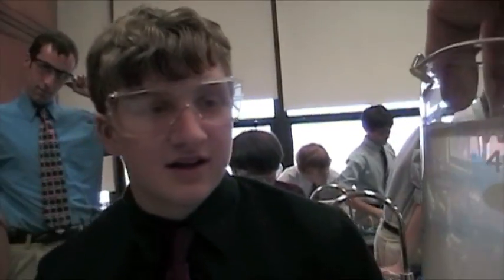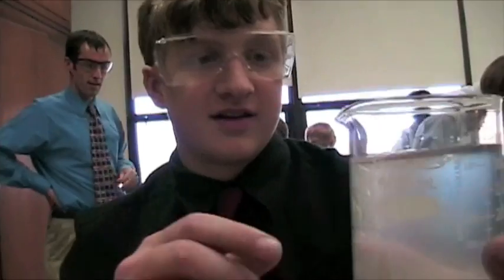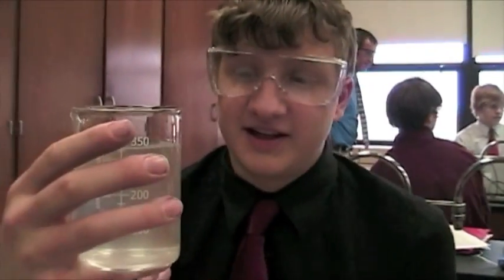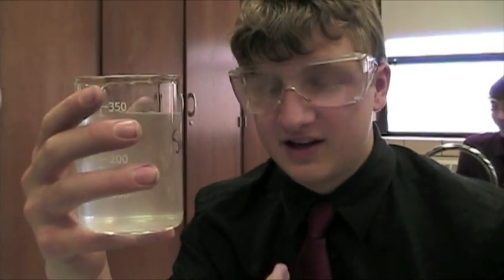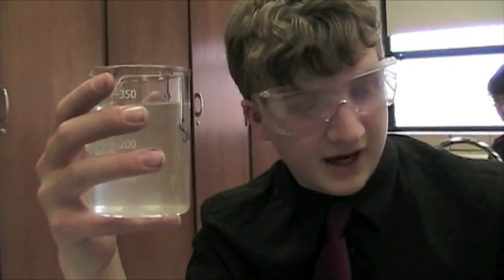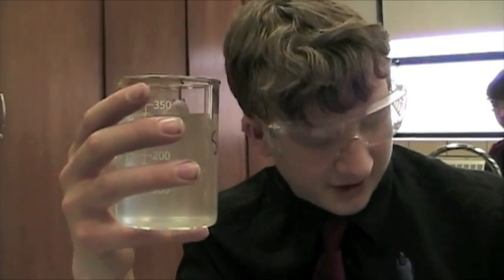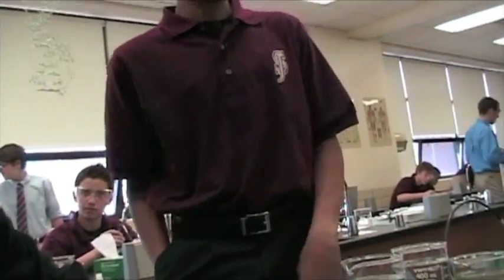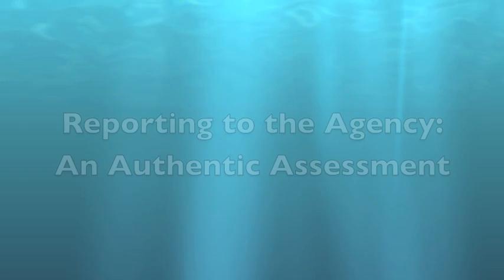All right, explain to me why sulfite has the least dissolved oxygen. Because the chemicals in the sulfite most likely use up the dissolved oxygen for other reasons, such as chemical bonds and other things that would not be found in the tap water. Something absorbed the oxygen. Something did. The only thing that could have been was the grass.